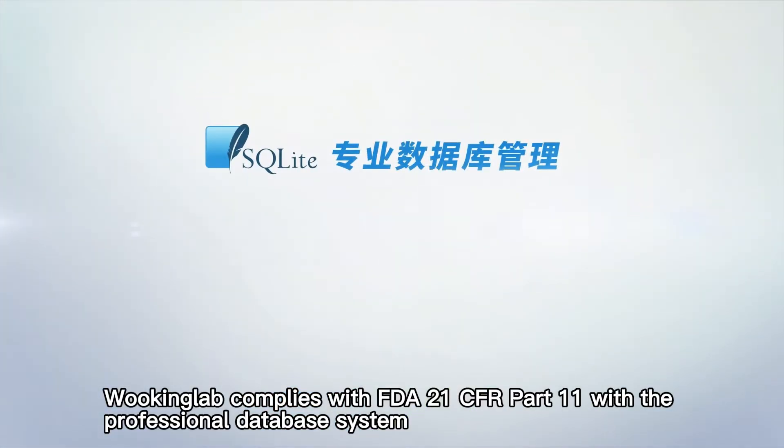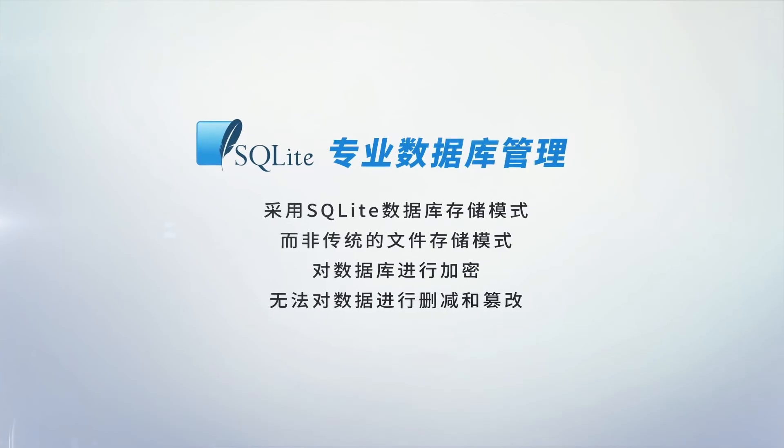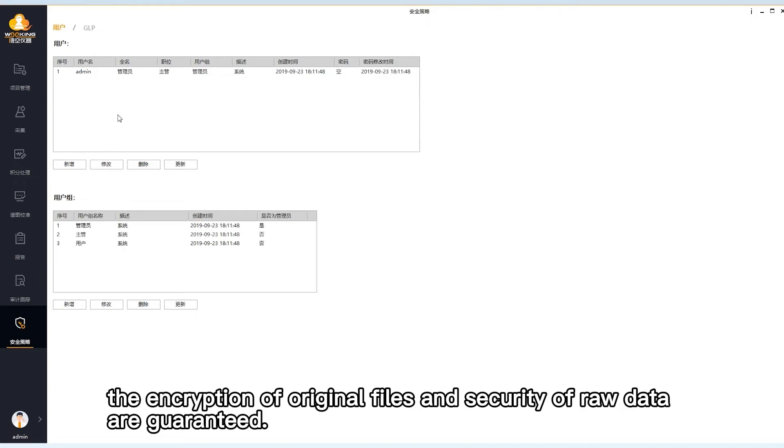Wuking Lab complies with FDA 21 CFR Part 11 with a professional database system, backup and restore of data, and multi-level user function. The encryption of original files and security of raw data are guaranteed.